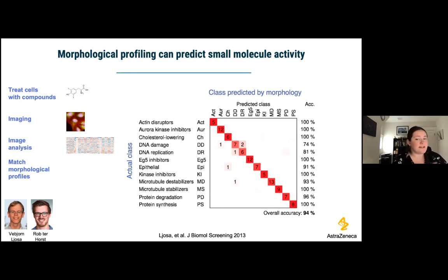And again, the mistakes that we're seeing are things that make sense for the most part. They're things like DNA damage being confused with things that change DNA replication, and those two processes are incredibly interlinked. So again, the confusion is as much about our need to biologically give everything one category as it is about anything that was actually wrong in the algorithm.